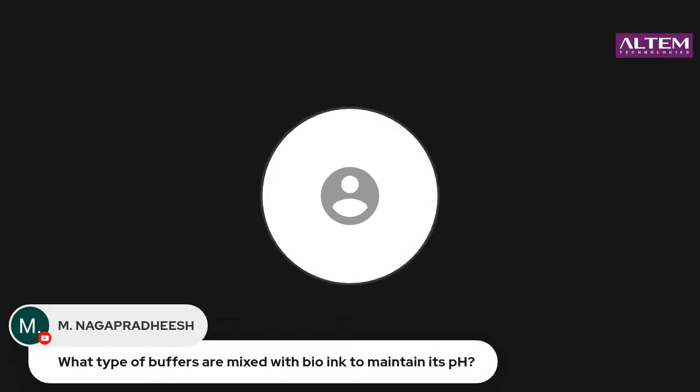Then this was also another question you asked. So the types of buffers that are used are called reconstitution agents. We use PBS, HPBS. We use sometimes just distilled water. We would sometimes even end up using some amount of materials like NaCl or some buffer salt solutions to work in this process of printing. So I hope this answers your question.